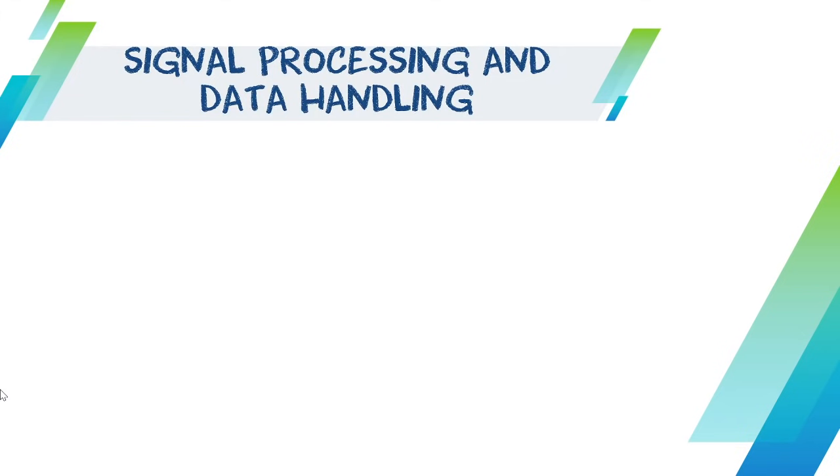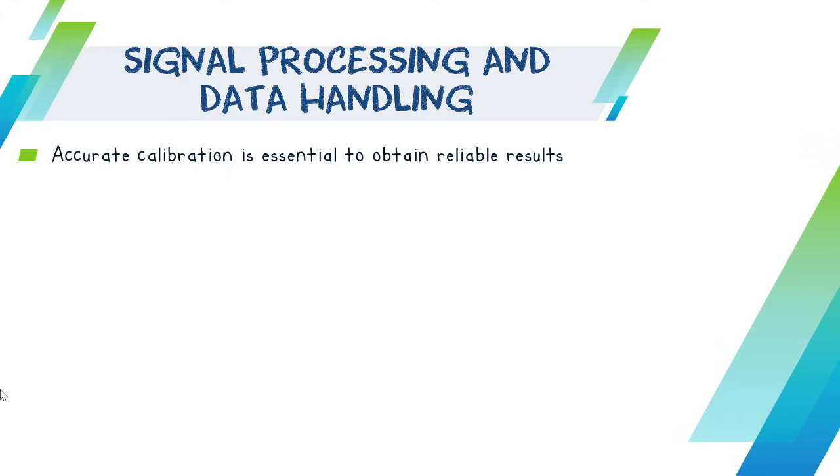Next, now we go to signal processing and data handling. Now, accurate calibration is essential to obtain reliable results. What is this calibration? When we do calibration, this is a way of assuring that our measurements are accurate. Calibration is done by comparing a known measurement, which is your standard, to the measurement being used in your instrument.